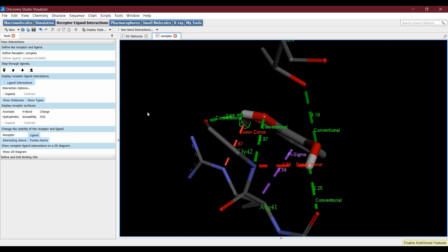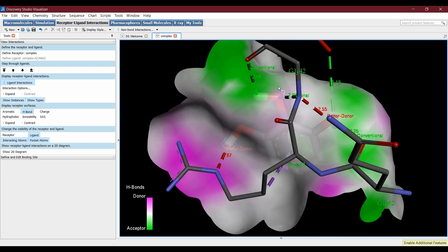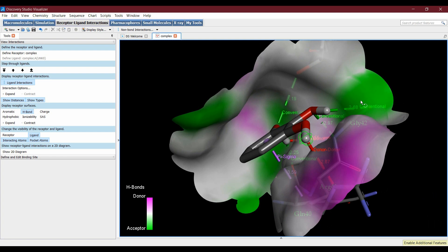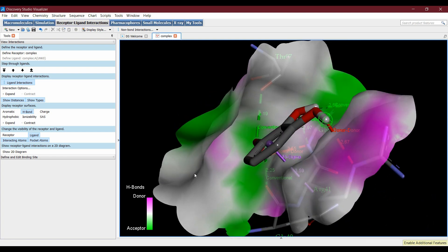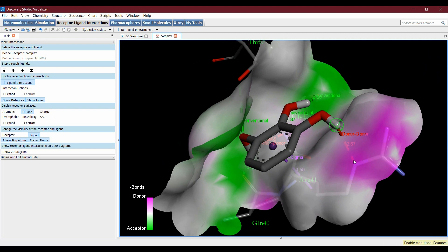You can also examine the receptor surface. Click on H Bond — this will show the receptor pocket, and the colors indicate hydrogen bond donor or acceptor regions. For example, one area is a hydrogen bond donor and another area is a hydrogen bond acceptor. In this fashion you can also analyze aromatic interactions, charges, ionizability, and more.